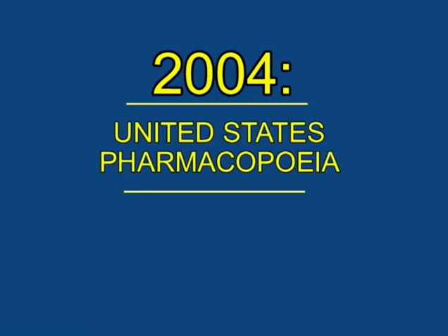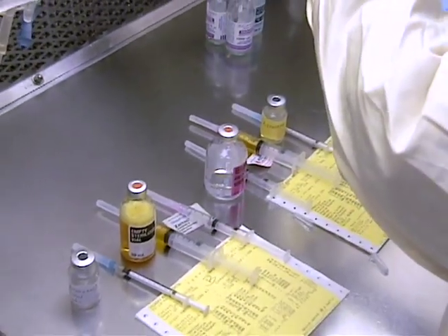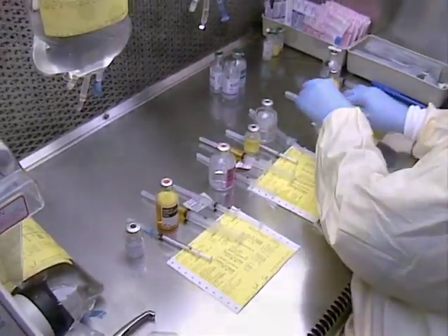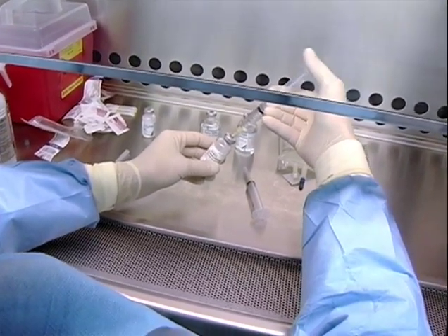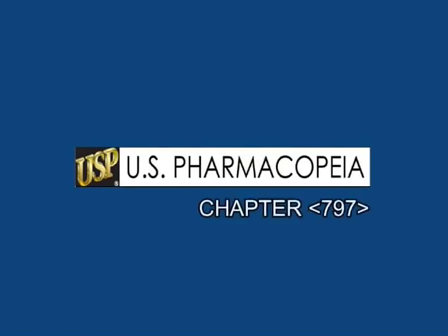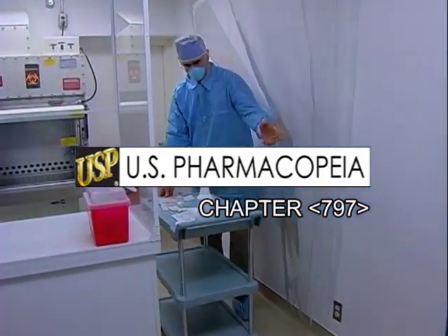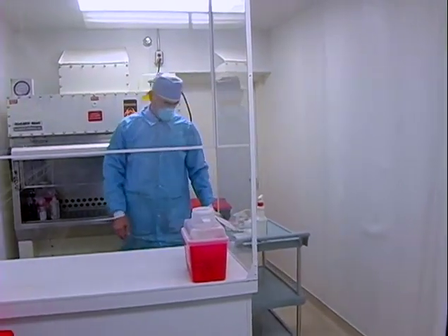In 2004, the United States Pharmacopoeia, or USP, introduced Chapter number 797 as a mandatory standard for the compounding of sterile preparations, or CSPs. This standard was updated in 2008 to include the latest requirements for institutions and individuals engaged in CSP compounding. USP 797, while yet to be acted upon and incorporated into the pharmacy practice legislation of many states, remains the reasonable and defensible community standard of practice to which practitioners will be legally held.